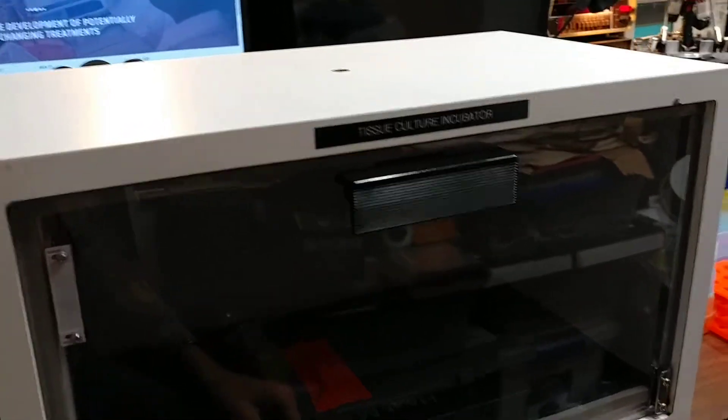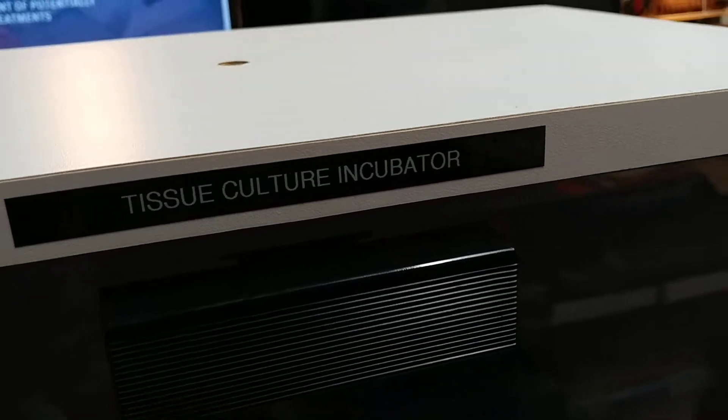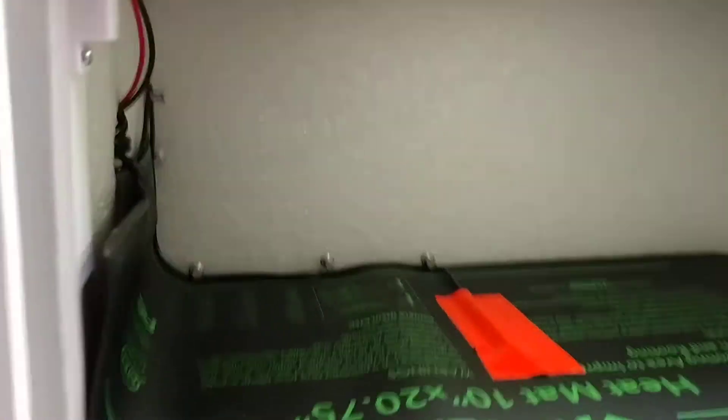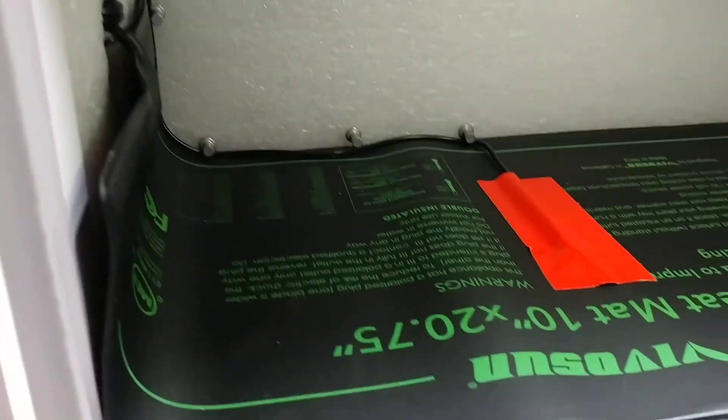Here is the tissue culture incubator that I made from a calorimetry experiment box. It is set up inside, and it even has a light that goes on when the door opens, based on a magnetic switch I've added.